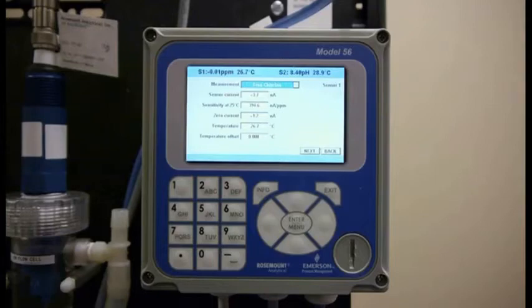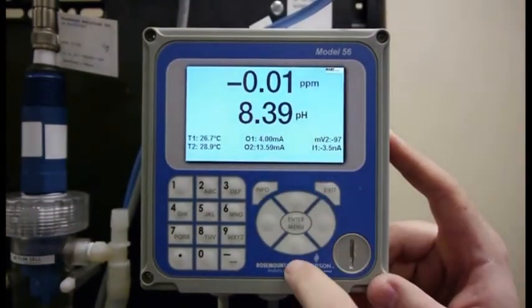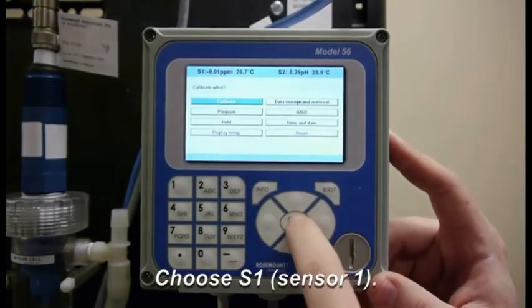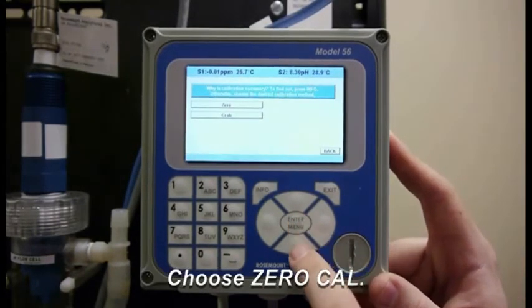So I go on to the next step where I'm going to actually zero the sensor. I'm going to Exit, now I'm going to go to Enter for the menu, I'm going to go to Calibrate, and I'm going to do Sensor 1 as it's our free chlorine sensor and I want to do a zero sample.